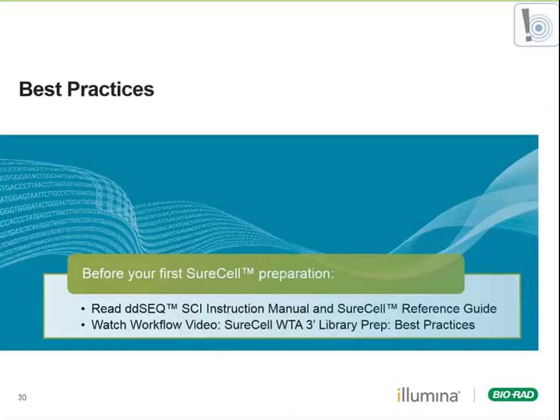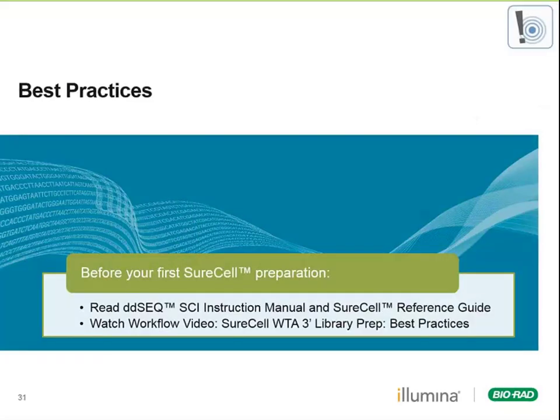That's it, you're all the way through the workflow, but let's take some time to highlight the important steps here. As a reminder, one more time, before your first preparation, you'll want to read the ddSEQ SCI instruction manual, set up the ddSEQ, and look at the SureCell reference guide. You'll also want to watch that workflow video on best practices, which contains even more detail and really nice images and video of the best practices I'll cover today.